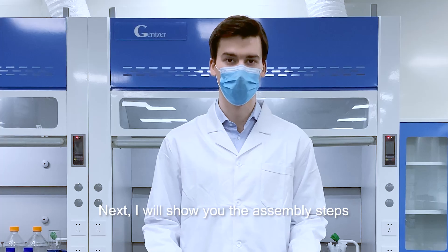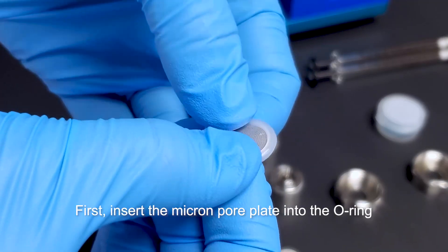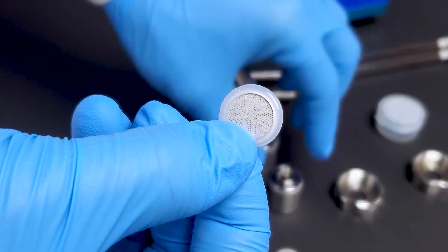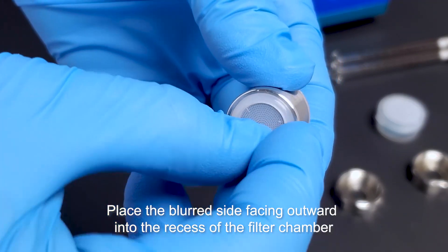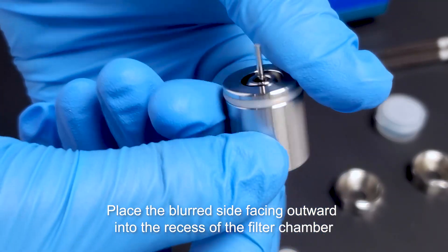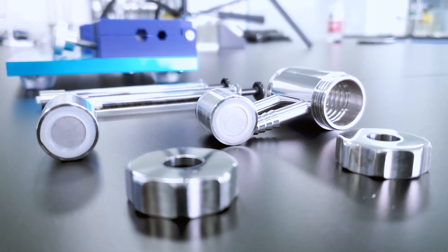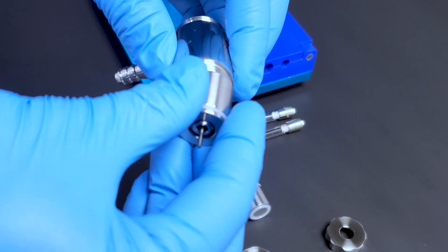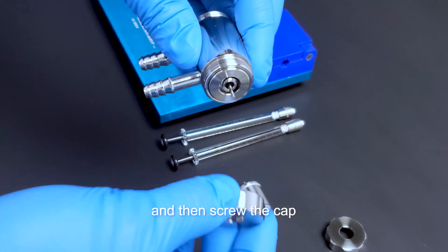Next, I'll show you the assembly steps. First, insert the micron pore plate into the O-ring. Place the blurred side facing outward into the recess of the filter chamber. Assemble one of the filter chambers into the metal body, and then screw the cap.